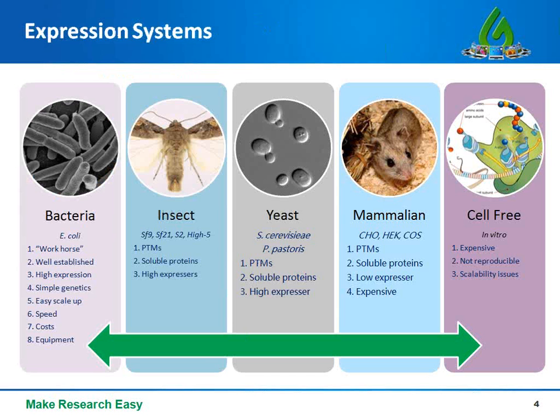In recent years, recombinant proteins can also be made in vitro using a cell-free translation system. However, this in vitro system is costly and not suitable for scale-up protein production. Most of the time, researchers choose among those 4 in vivo expression systems and use the cell-free system as a last resort.